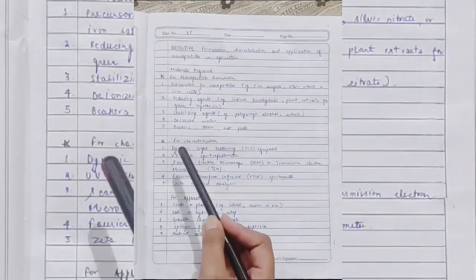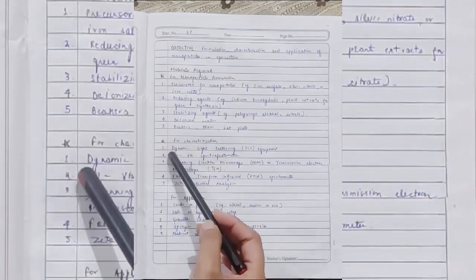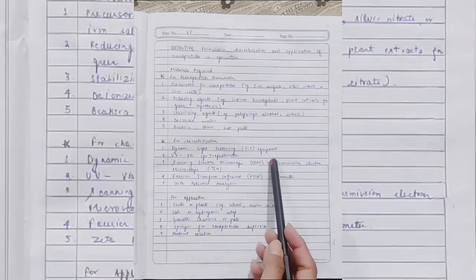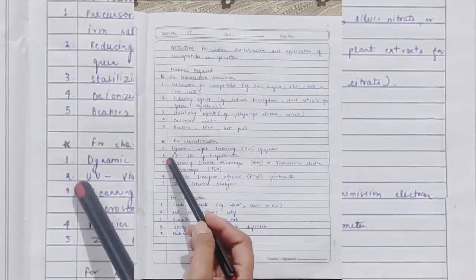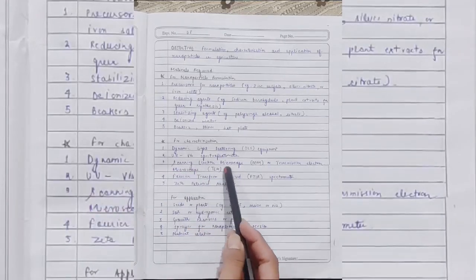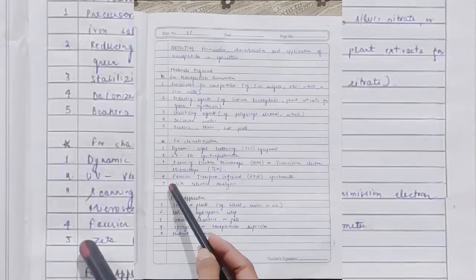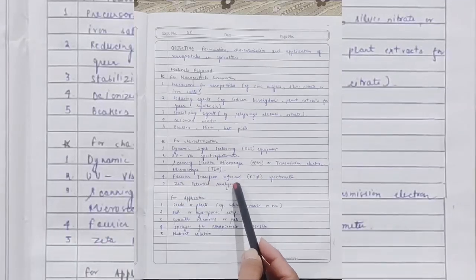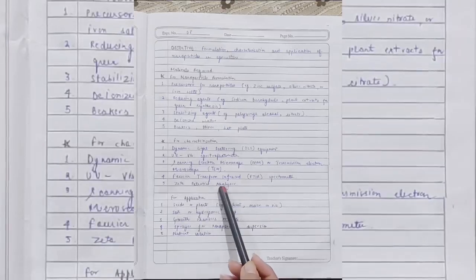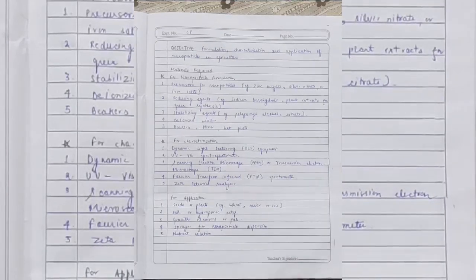So guys, going ahead, for the characterization of the nanoparticles, we need the following things. First of all, we need dynamic light scattering, that is a DLS equipment. Next, we will need a UV spectrophotometer. And the third one will be a scanning electron microscope or transmission electron microscope. Next, the fourth one being Fourier transform infrared spectrophotometer, and the fifth one being zeta potential analyzer. So these are basically the materials required for the characterization.